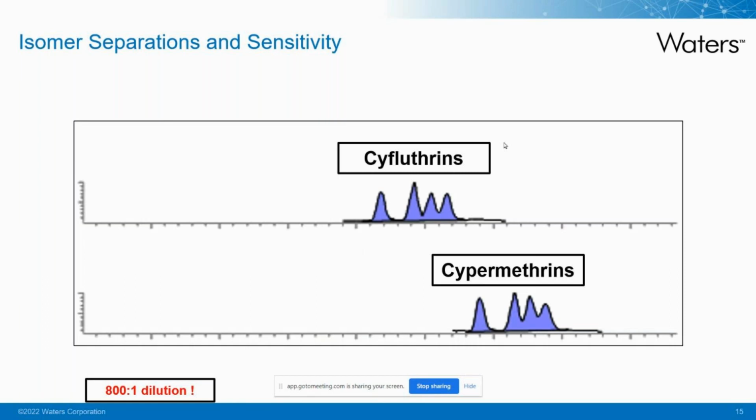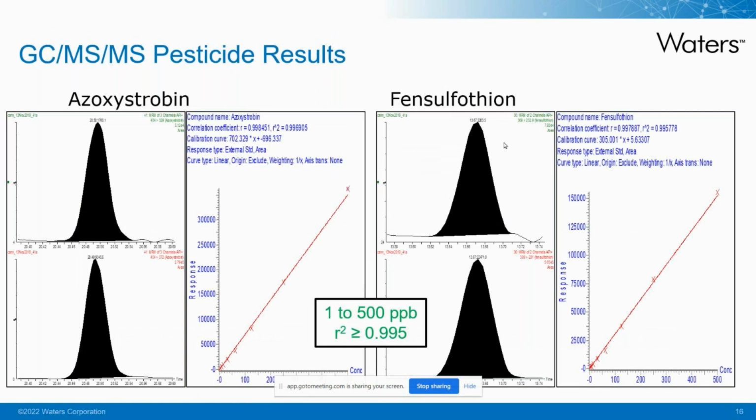1/4 of that 10 nanograms, and that means for each individual peak, we're looking at what amounts to an 800 to 1 dilution. So to get the broad coverage with a generic cleanup, we end up with a series of stages of dilution, including among the isomeric species that we have among the pesticides. So sensitivity is very important as we then look into specific analytes extracted from cannabis in this study.